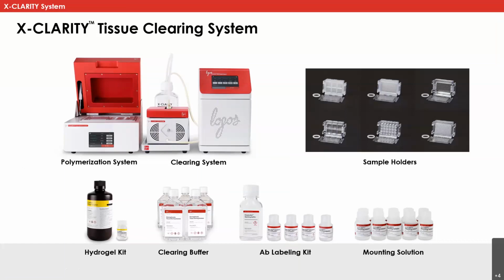And so you can do that with a vacuum chamber and flushing out nitrogen, or you can do that with a simple system where you put in your samples in here, you close the lid, and you press run. And what it does is it removes the oxygen, puts it up at the necessary temperature, and 3 hours later, the samples are polymerized. So it makes life a lot easier.